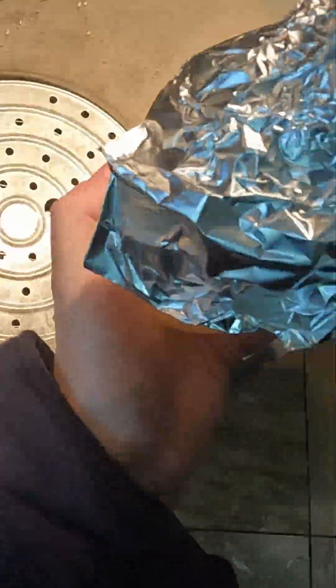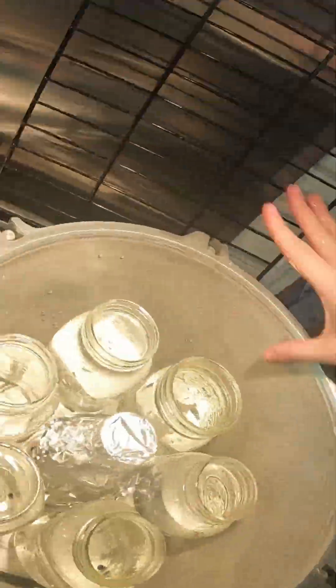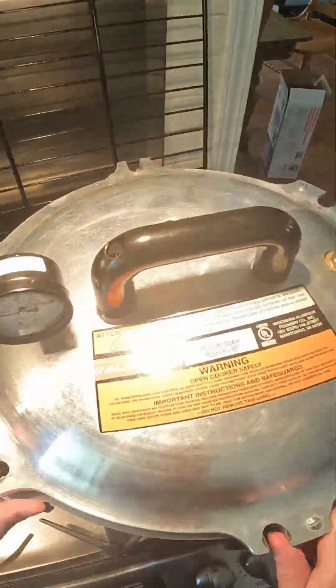While your oven is preheating, you should be filling up your pressure canner with enough to just space it out pretty evenly, just for a heat sink. Put your agar in the center. You're also going to want to apply olive oil to the mating surface on the inside of your pressure cooker before making sure it's even and sealing it completely.